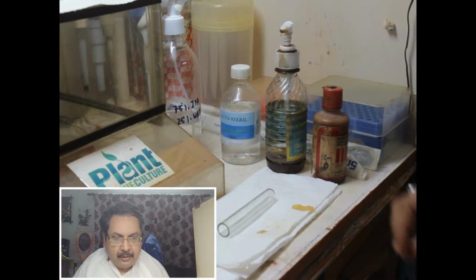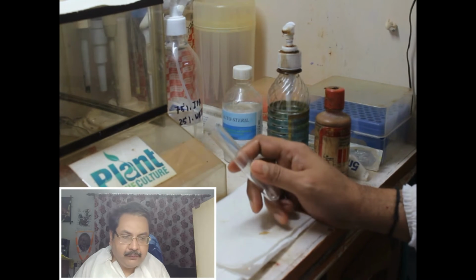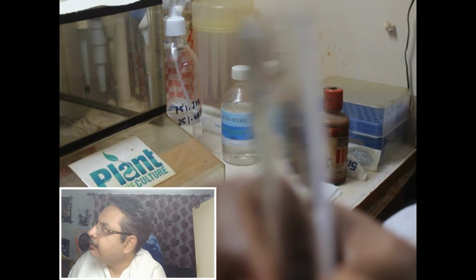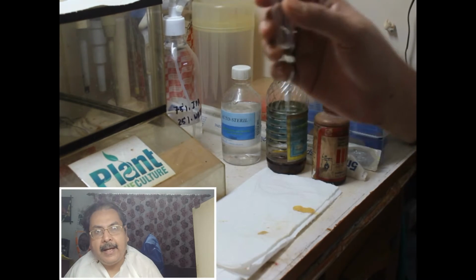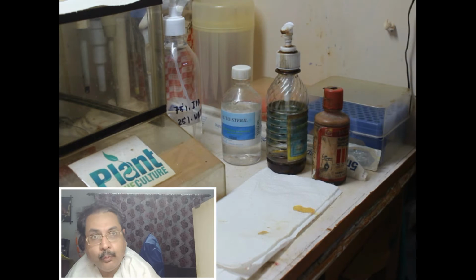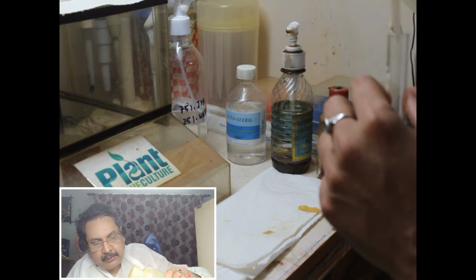So friends, our second part. Now we are talking about distilled water. First we will take a test tube, as you can see, and we are going to take some of our laboratory distilled water to test whether it is distilled water or not.